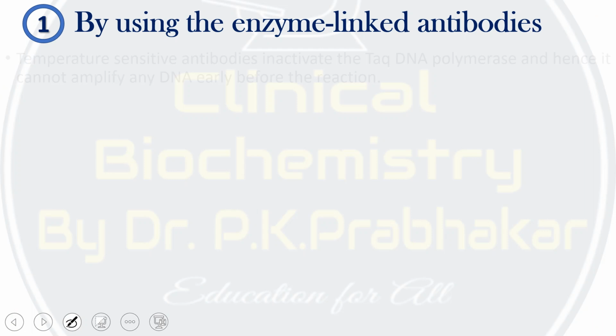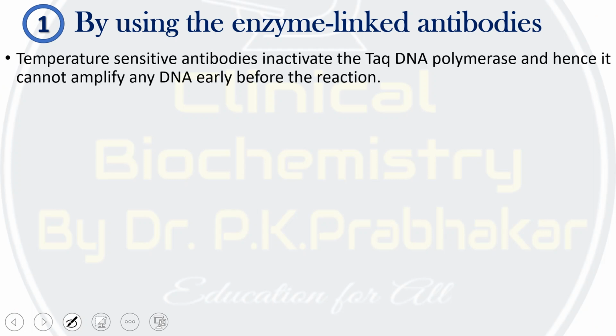This is a very novel way to inactivate Taq DNA polymerase. Here we take temperature-sensitive antibodies. The polymerase is linked with the specific antibody, which keeps it busy, hence it cannot amplify the DNA early, before the reactions.